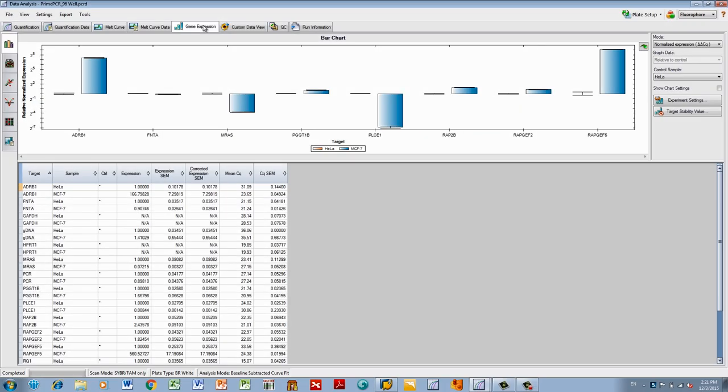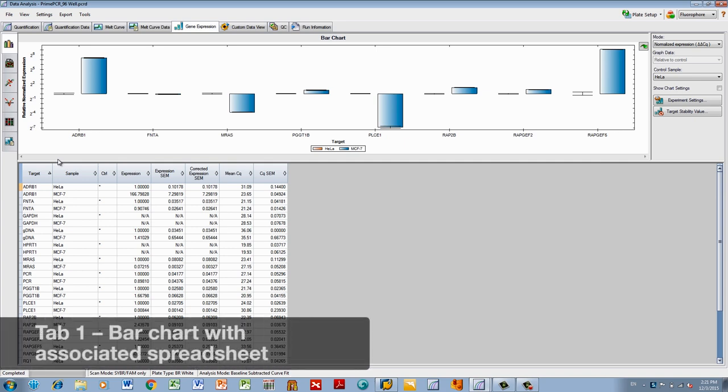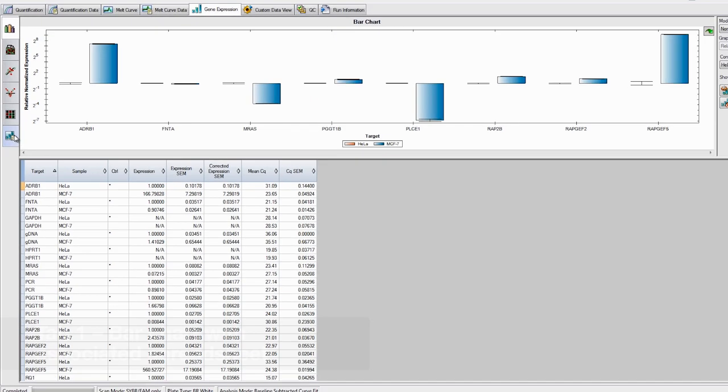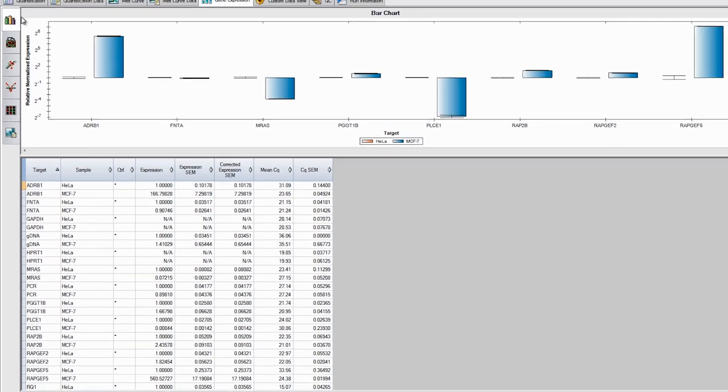Within the Gene Expression tab, you have several options to help with data interpretation. First, you see a bar chart illustrating your data and the associated spreadsheet with the raw data. There are also several other views available on the left side menu.